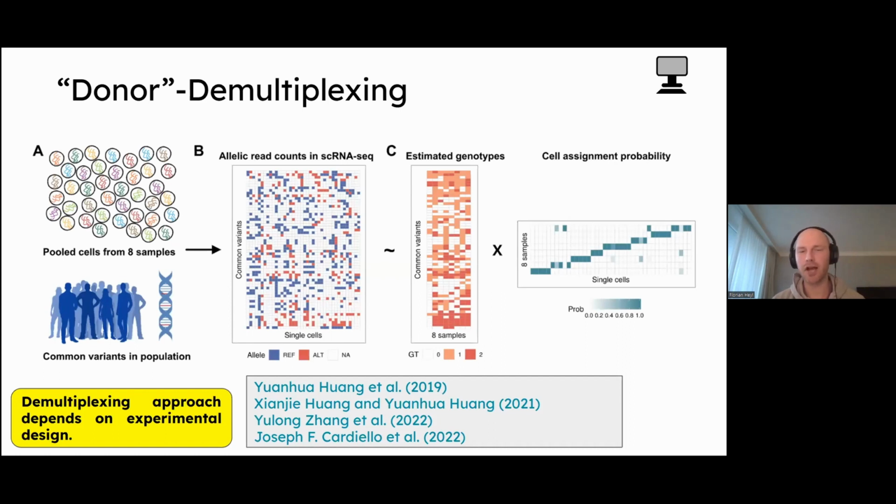What I quite often ask, and maybe somebody is already wondering, is why should I do this? So far, what I found in the literature is that it is more cost efficient and also more time efficient. This is at least what I found in the literature as an advantage.